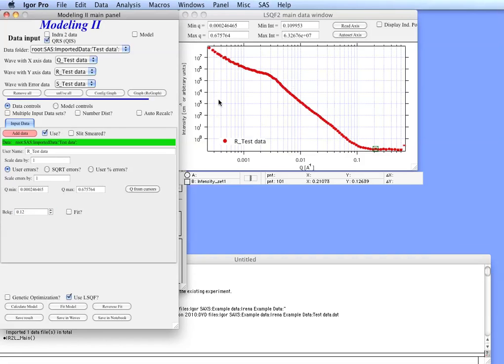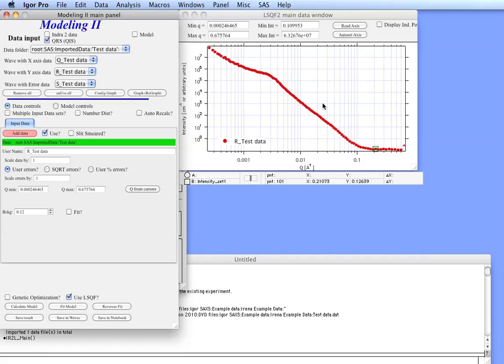So now we have the data in there. Next thing what we need to do is select the range in which we are going to be fitting. From this data, it's a mixture of large stuff which is at low Q and fine stuff which is somewhere up here. It's not easy to see but there is some scattering from it here.